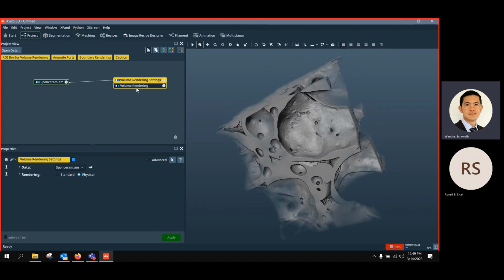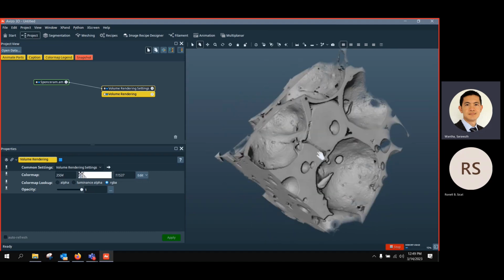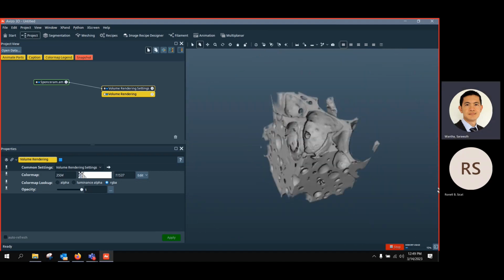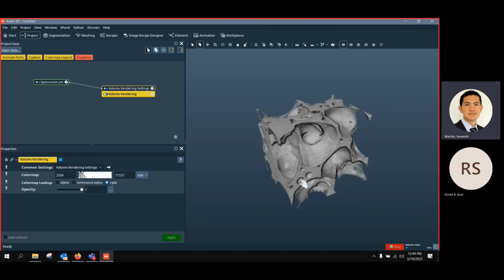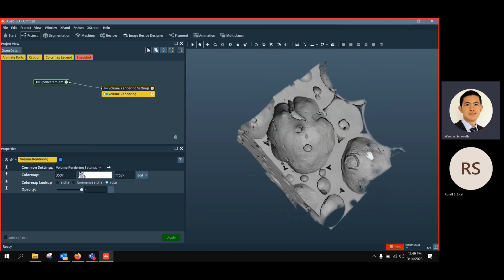And you have here these foam bubbles, and the aim of this network modeling is that we want to study the connectivity between the pore space inside of this material. You can see that the pores have different pore sizes, and the connectivity controls the link between the pores. So okay, let's start. We need to do some segmentation of the pore space, and after that we're going to connect them by selecting axis connectivity and then start to calculate the network model. Okay, so let's start.